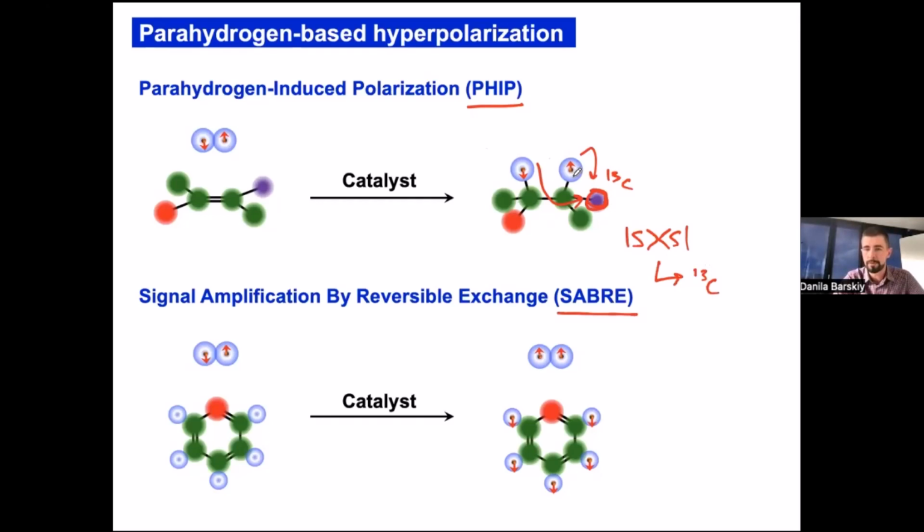And in order to preserve polarization, to really use it for something useful, most of the time you want to immediately, once you produce parahydrogen polarization, transfer it to carbon or to nitrogen to allow it to survive for much longer, and then inject, for example, and observe metabolism directly on this heteronuclei. Or alternatively, you can still bring it back for detection on protons, because for sensitivity reasons it can be advantageous, but for storing reasons, I think it's most reasonable to store on heteronuclei such as carbon, nitrogen, or some more complicated spin states. Okay, thank you.